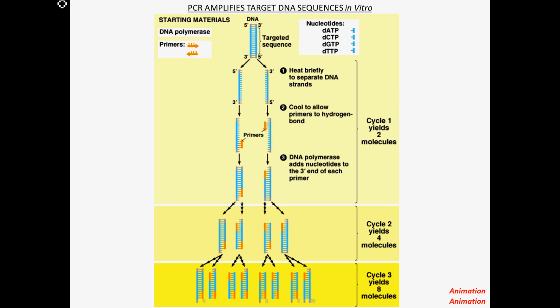The PCR stands for the polymerase. This is the P. Polymerase chain reaction. Chain reaction. So a chain reaction is once you get it started, it keeps going and going and going. And the polymerase here that they're going to refer to is a DNA polymerase, right? And it's actually a special DNA polymerase, which we'll talk about in just a little bit.